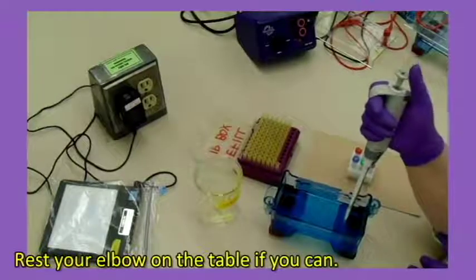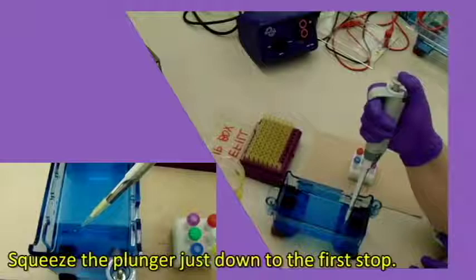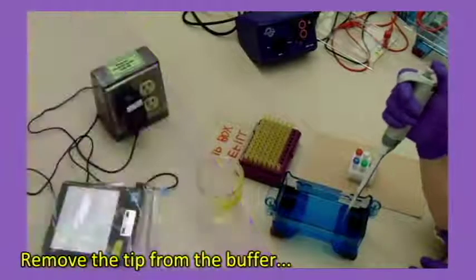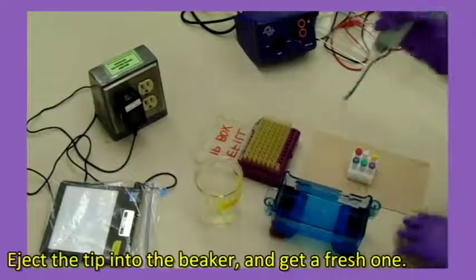Rest your elbow on the table if you can. Lower the tip into the well. Squeeze the plunger just down to the first stop. Remove the tip from the buffer and then release the plunger. Eject the tip into the beaker and get a fresh one.